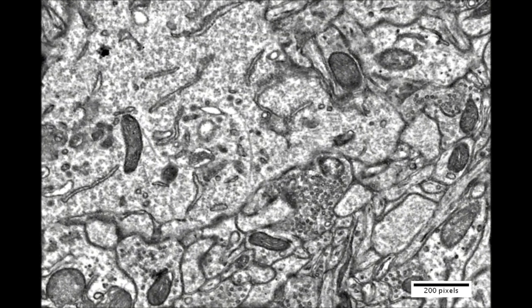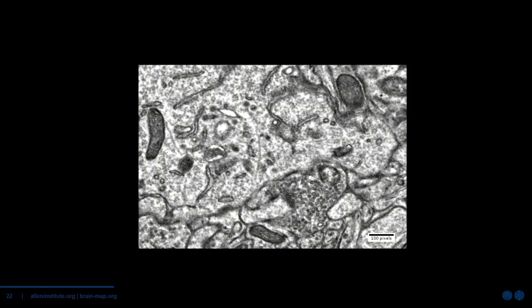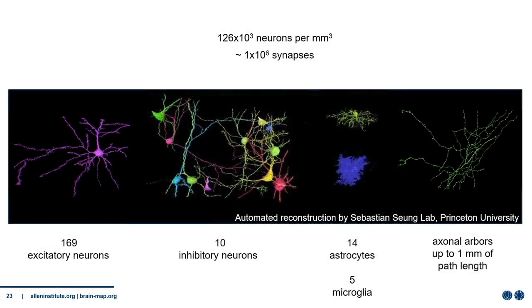So it is a black and white image, but what Sebastian Seung did for us is color it using, basically, neural networks. By coloring it, we could extract all the neurons that were in that volume, which was about 200 microns by 150 microns by 150 microns in depth, of which 40 microns were completely segmented. And from that, we could extract the excitatory neurons, of which we see here an example that matches nicely to one of the clusters of excitatory neurons that you see in IVSCC.